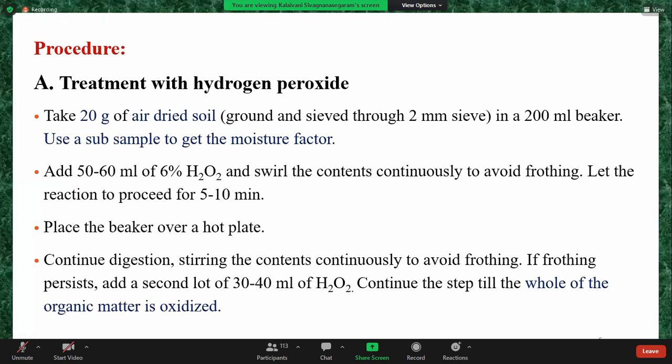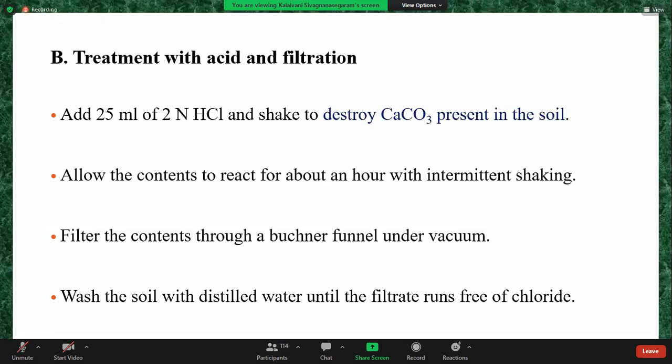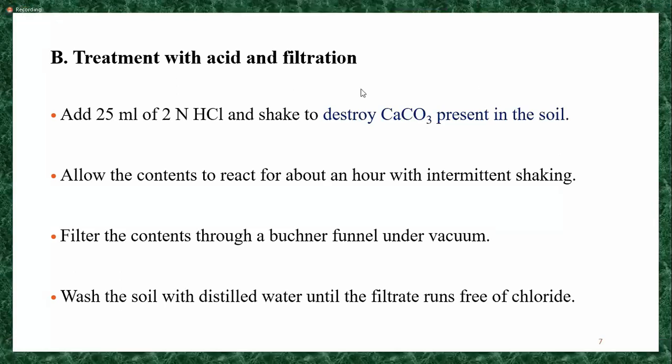Okay, then let's move into the second step. Can anyone read the slide? I'm just asking you to read. Ma'am, can I read it? Yeah. Treatment with acid and filtration.